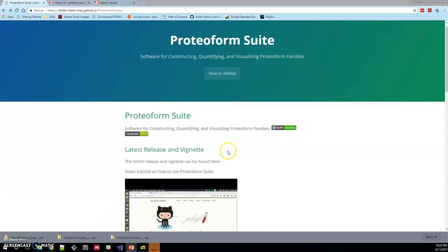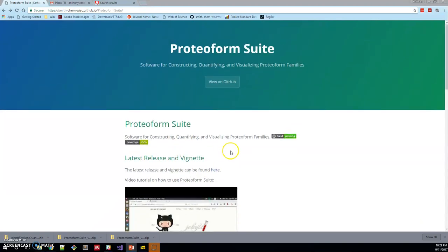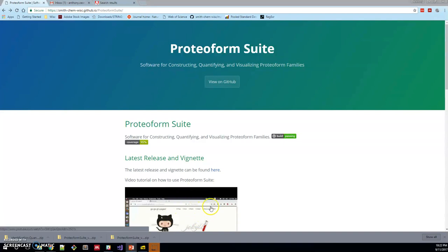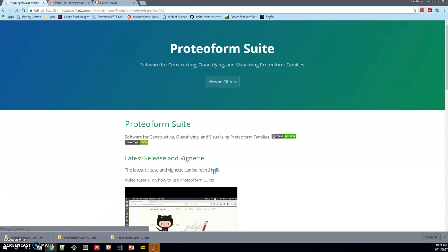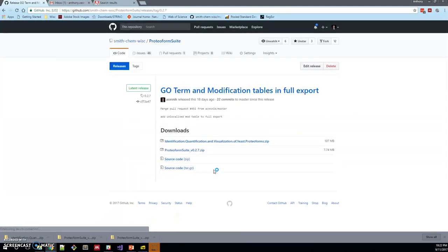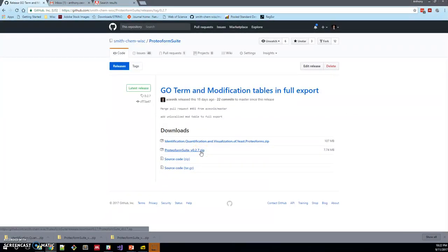This is our Proteoform Suite website and there's a placeholder for this video here. You can find the release and a vignette that I'll go through at this link. So let's click this link and go there. This is the release here, version 2.7, the latest release so far.